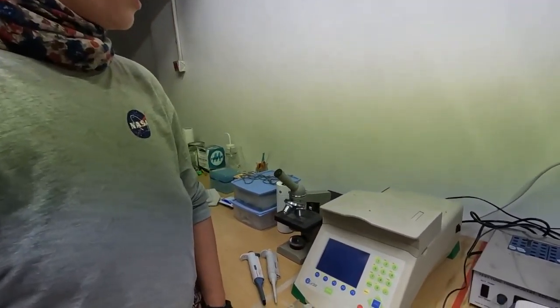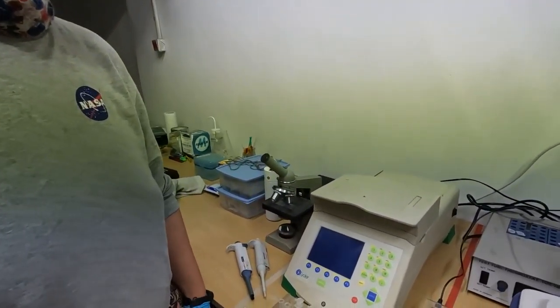This is our molecular biology equipment. This is a PCR machine, a micro centrifuge, and we have some samples here where we were extracting DNA. There's the electrophoresis machine which we built ourselves and some other cool things here.